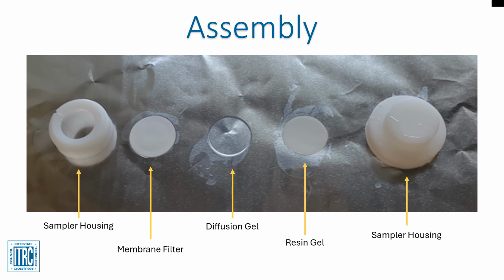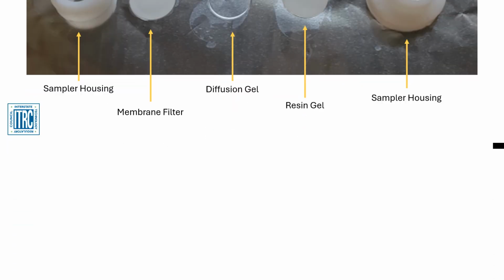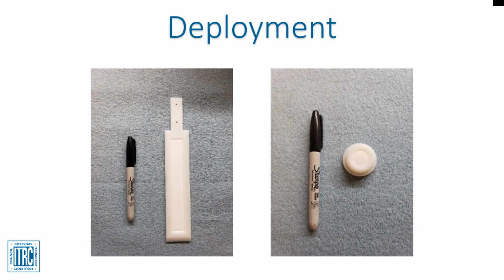After deoxygenation, the device should be carefully shipped in sealed oxygen barrier bags on ice in a cooler to the site. The dimensions of the gel layers vary depending on features of the environment, such as the flow rate of water being sampled. Deployment of the DGT device typically involves suspension of the sampler in situ or in a stirred solution in the laboratory or in the field for a fixed period of time, typically ranging between 1 to 24 hours.